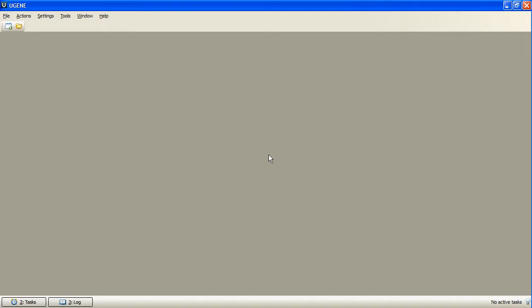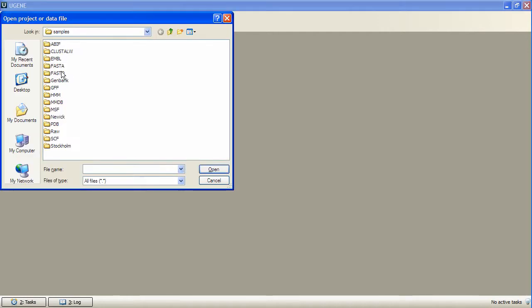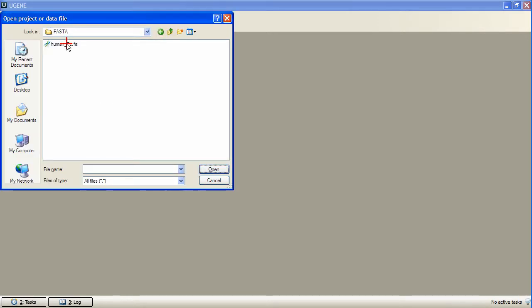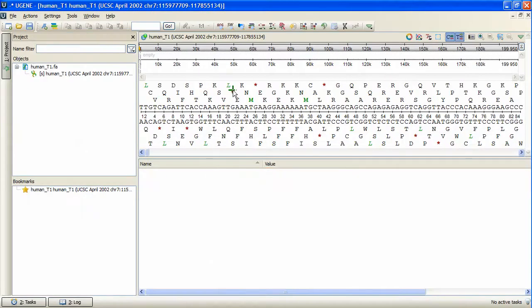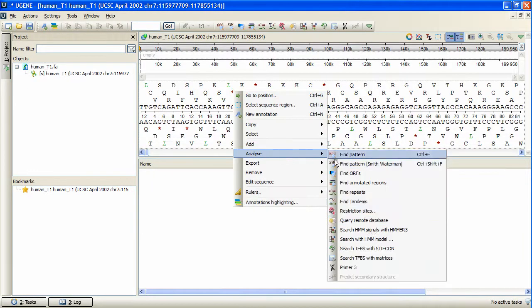Users can create and save position weight and frequency matrices and align the transcription factor described by these matrices to an opened sequence. To invoke the plugin, we open a sequence, for example, this FASTA format sequence, and then right-click and select Analyze, Search TFBSs with matrices.